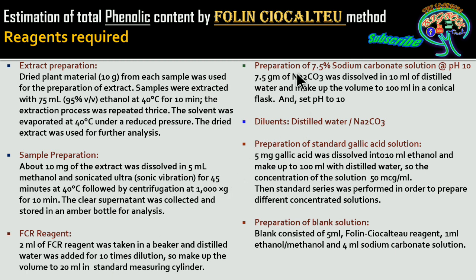So further, we are going to prepare the sodium carbonate solution at pH 10, so this will be the composition. And further, we are going to prepare the diluents which are necessary if there is a requirement in the procedure. One diluent will be distilled water and the other diluent will be sodium carbonate at pH 10.